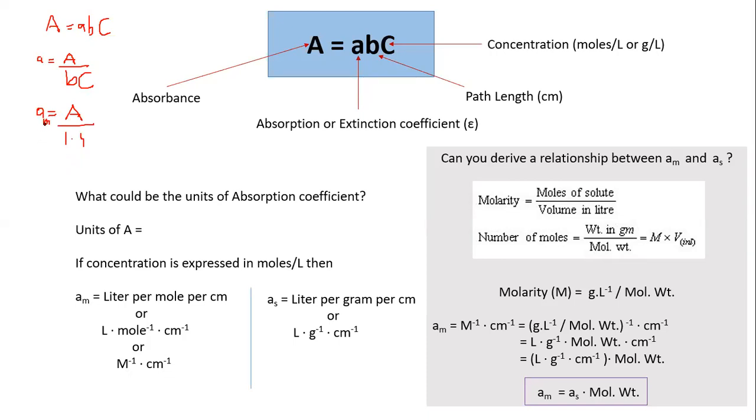Molar absorption coefficient is nothing but absorbance of that particular compound per unit path length, that is 1 centimeter path length, and 1 molar concentration. So it is nothing but absorbance, representing absorbance in standard terms. Are you getting my point? Okay.